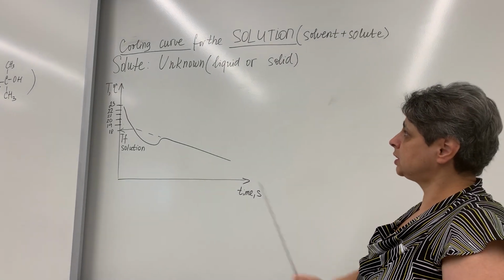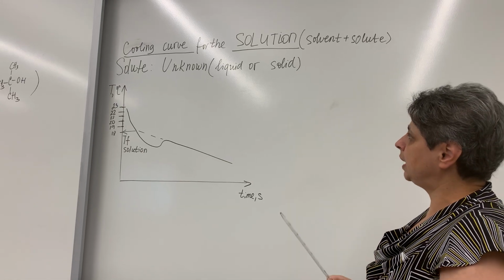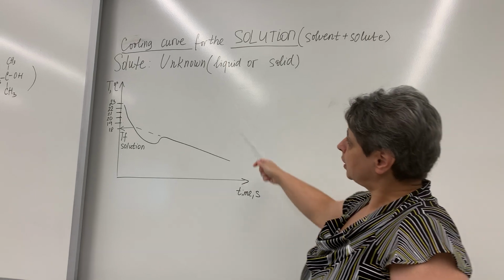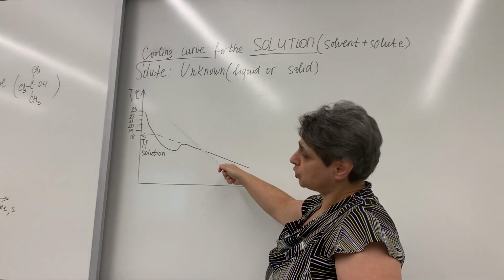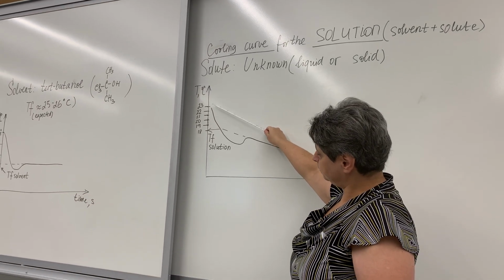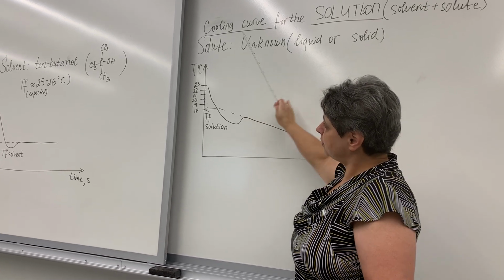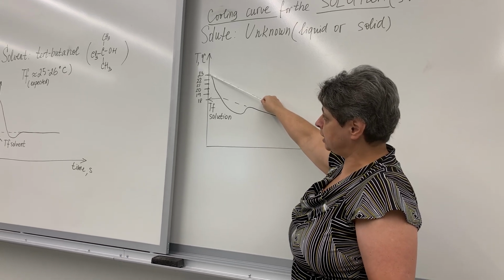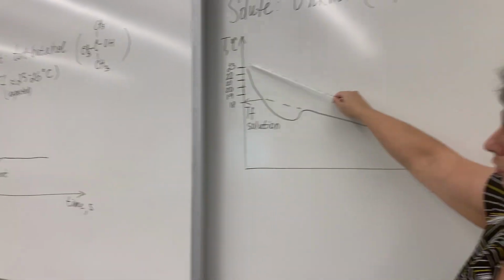By the way, the densities of the unknown liquids, I believe, are given in the notes. I skipped that earlier, but I think these densities are provided. So you can find the mass of the unknown liquid based on volume and density, sort of like you did in the Prelab. Here, the freezing point is determined starting at a lower temperature than before. For pure solvent, we start at around 28 degrees. Here you start at around 23 to 24 degrees, you start your cooling.